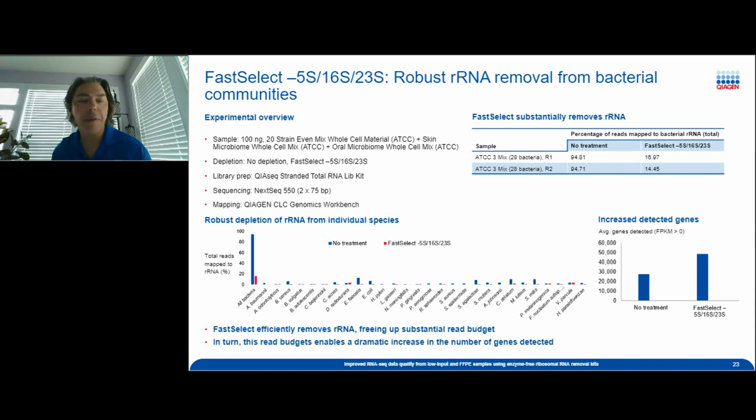This comes back to what data we have in the database that we can design for. What we don't know about, we basically don't know, and so there's not a design for that. That's why we see some of this ribosomal RNA sneaking through.